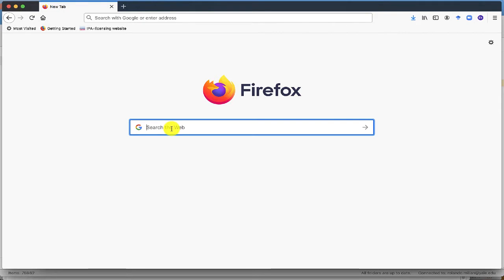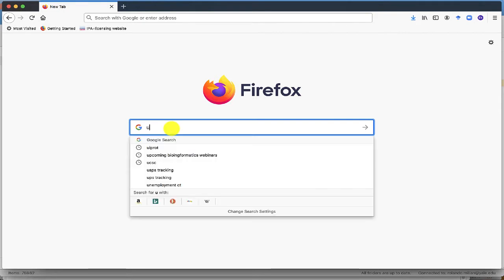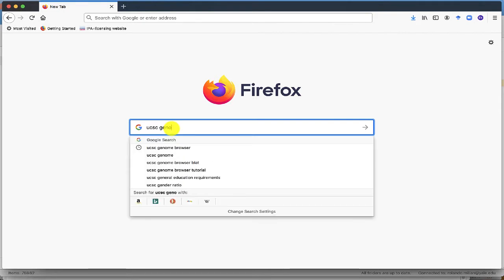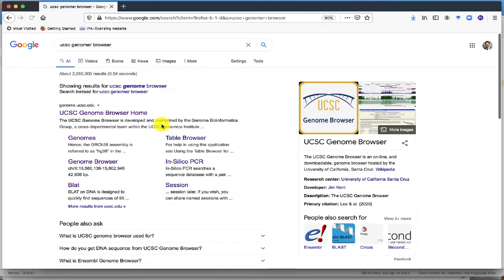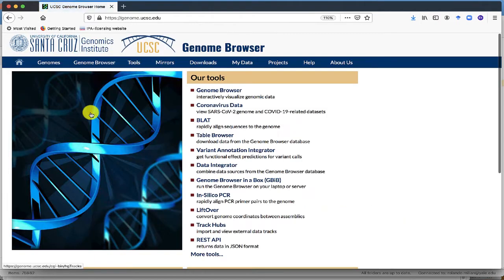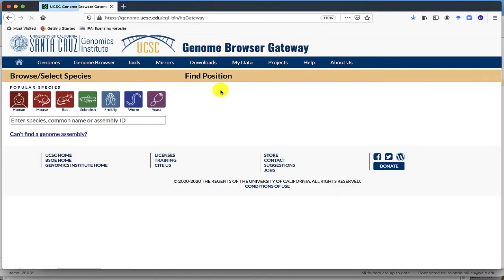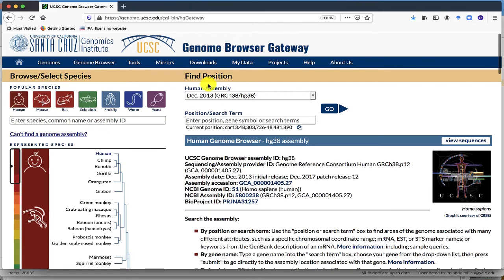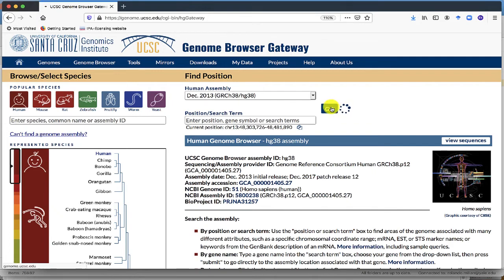Just search for the UCSC Genome Browser, click on the Genome Browser, let's use a human assembly as an example, click on Go.